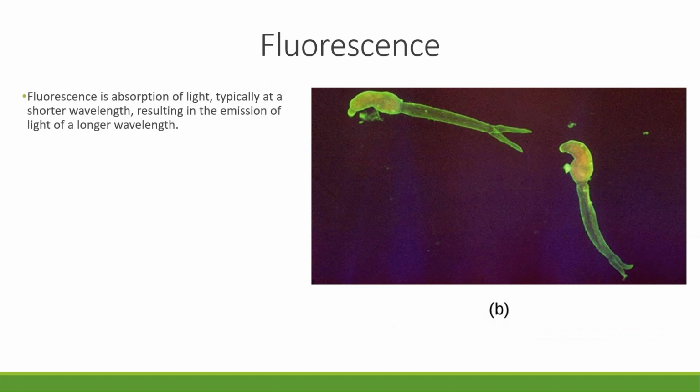It utilizes fluorescence, which is the absorption of light by a substance, typically at a shorter wavelength, and results in that substance emitting its own light at a different color at a longer wavelength. If you need to refer back to the scale I showed you of the different visible light waves, please do. But violet is on that far left side and has the very short wavelengths, and all the other colors you can see are going to be longer wavelength all the way over to far red.